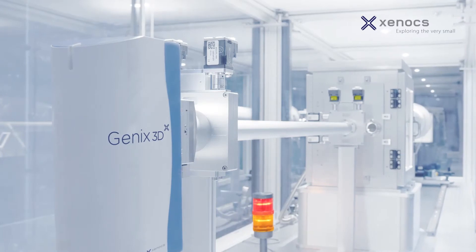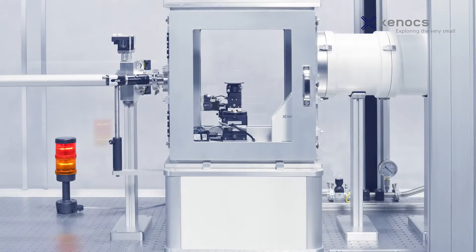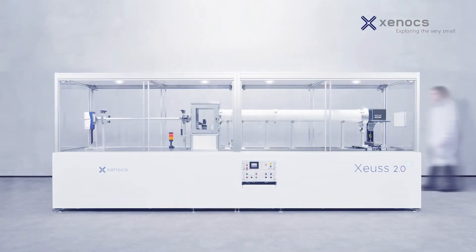Opening the way to new SAXS/WAXS measurement capabilities, Xenocs introduces a new generation of SAXS/WAXS systems: the XEUSS 2.0.